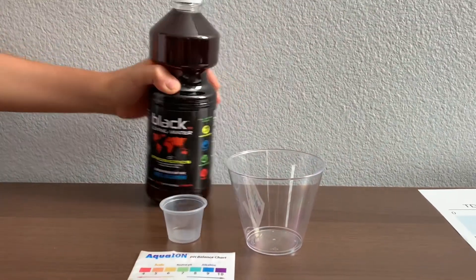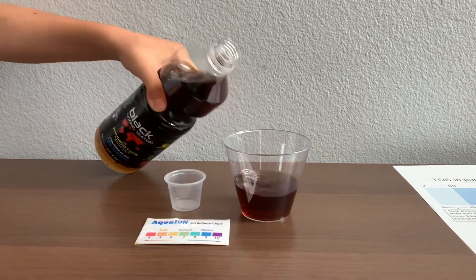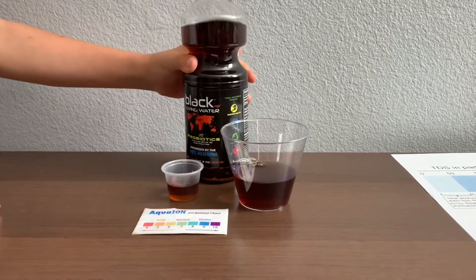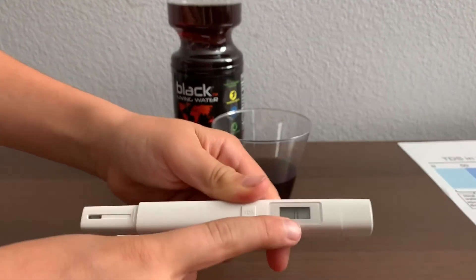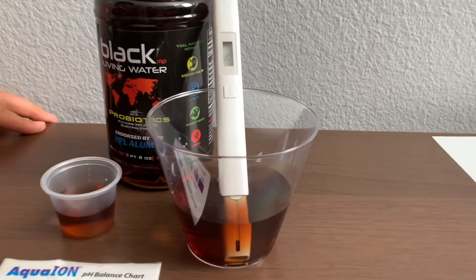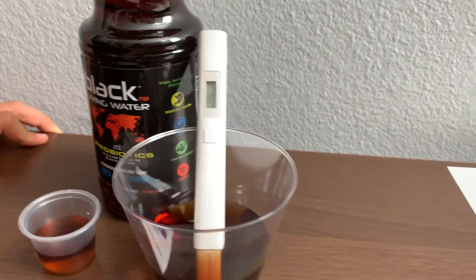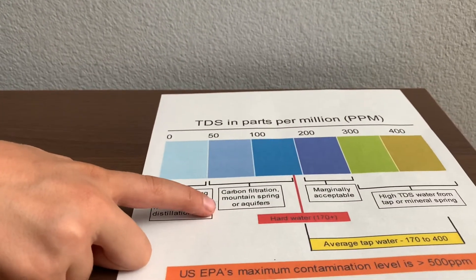Let's pour some water in. First, let's test the TDS level. Turn on the TDS tester, make sure it says zero and put it in. 75. That is carbon-filtered mountain springs or aquifers.